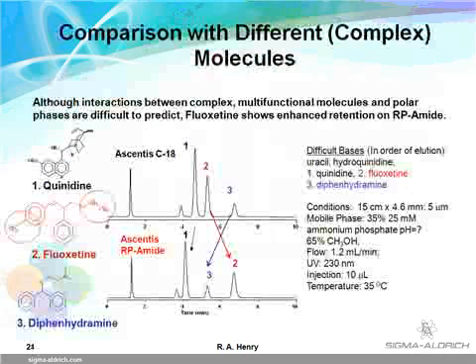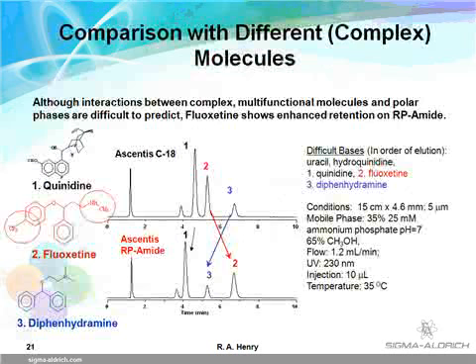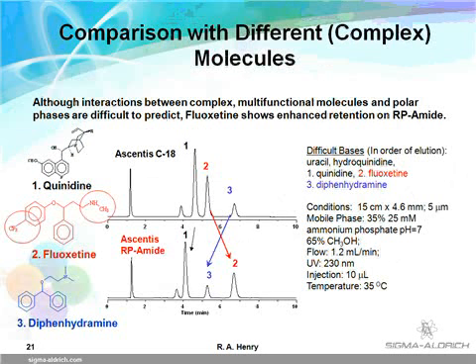As shown in this next slide, HPLC phases with built-in polarity or polarizability can show more retention and selectivity than C18 when molecules have a polar functional group, such as nitro, hydroxyl, amino, and others. Note that this is the case for simple nitroaromatics. The extra retention for Ascentis phenyl is believed to be due to formation of strong pi-pi complexes between solute and stationary phase. Nitroaromatics are pi acids, while the phenyl phase is pi basic, which can help explain the stronger interaction.